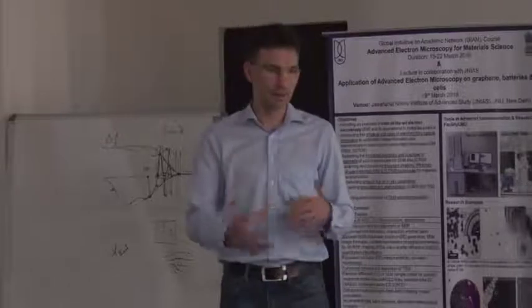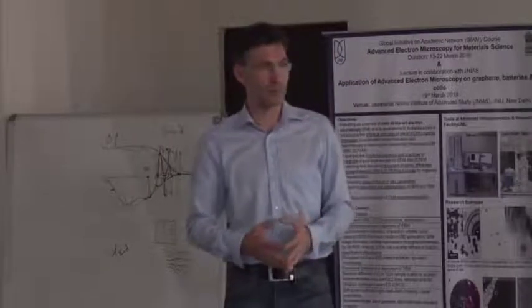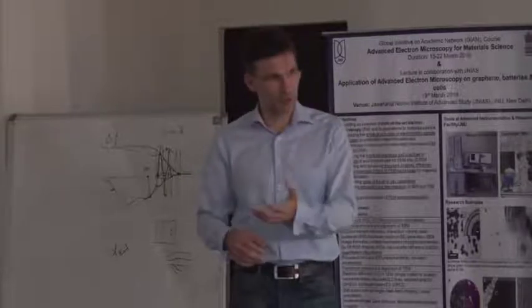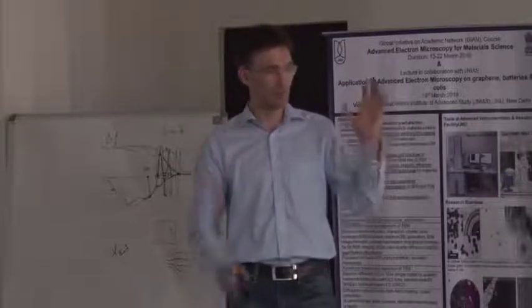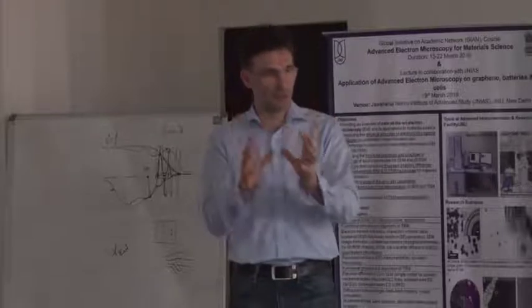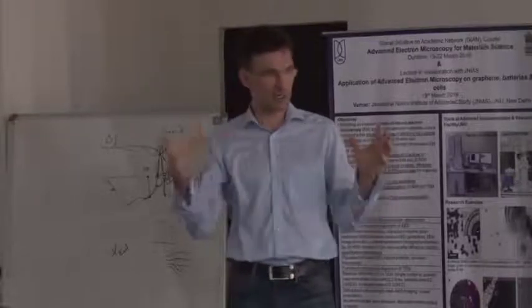There are software routines and packages available which actually do that for you. There are also iterative procedures which even allow for the optimization of the tilt series during the whole reconstruction process. What you currently do is you have all your projections, you back project or reconstruct your structure, and from there easily calculate new projections that you can compare to your experimental data.